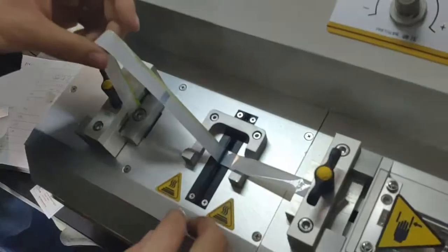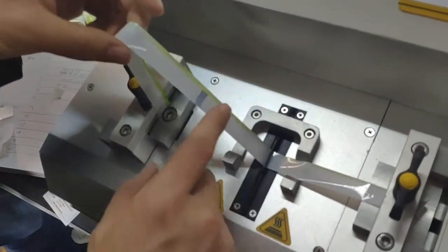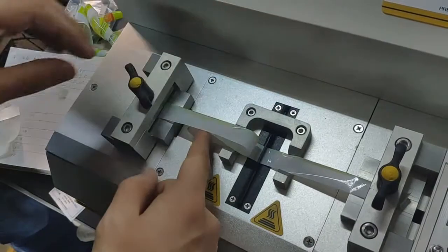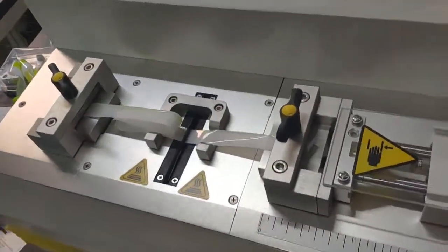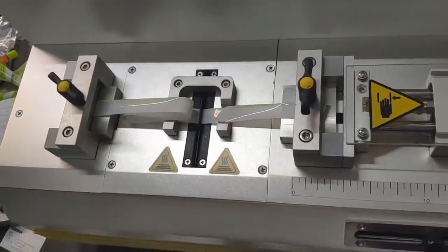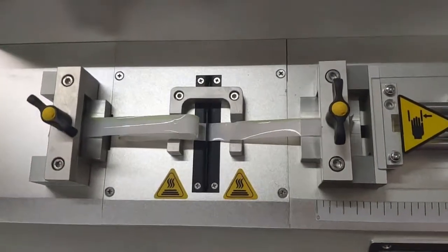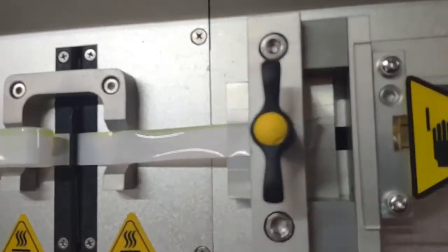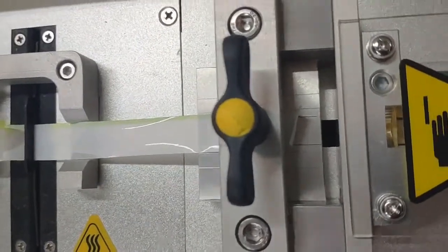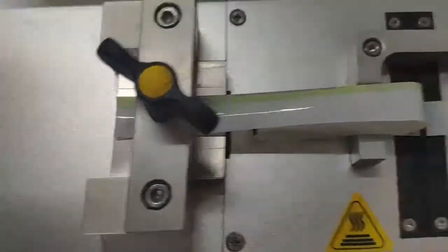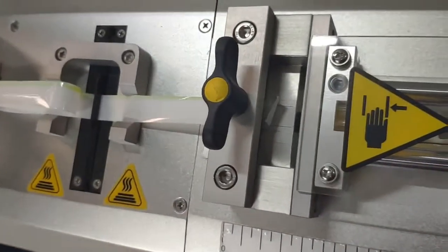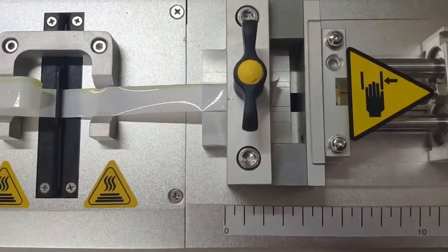And clamp them. Now we finish the sample installation. But there is another point you have to know. We need to make sure the two ends of the sample are positioned on the left and right jaws.